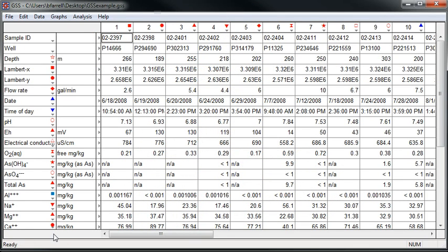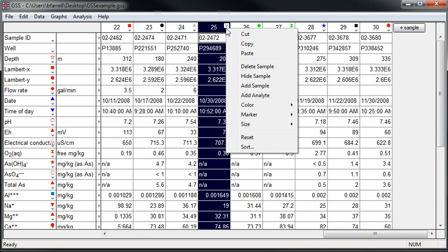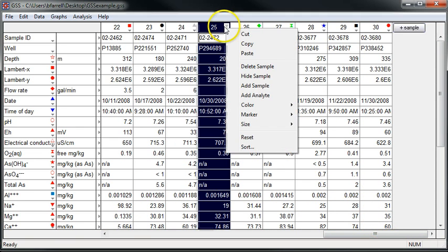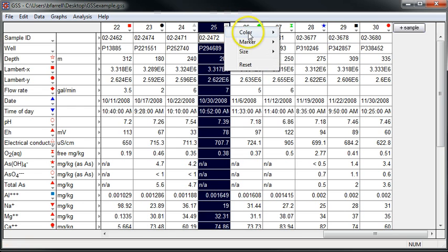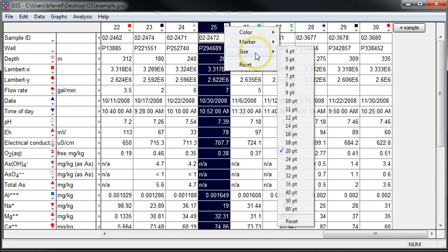Here I've opened up a GSS spreadsheet in which I've stored analyses for a number of samples. Each sample will be represented on the plot by a marker for which we can set the color, the shape, and its size.